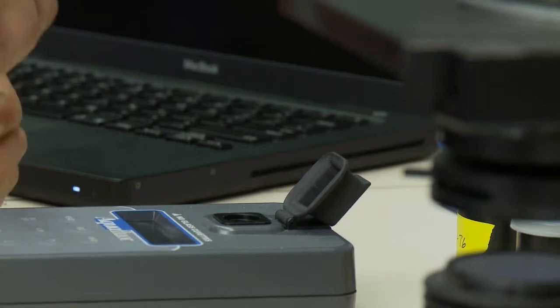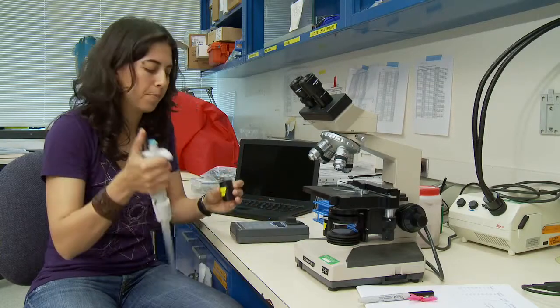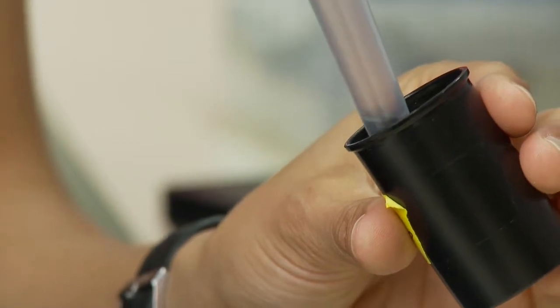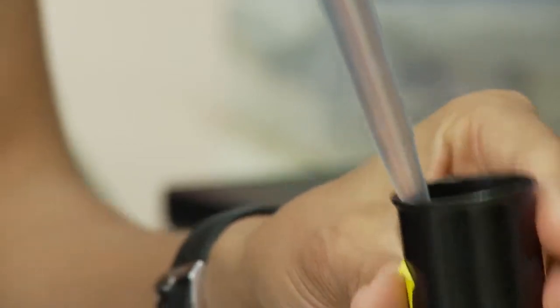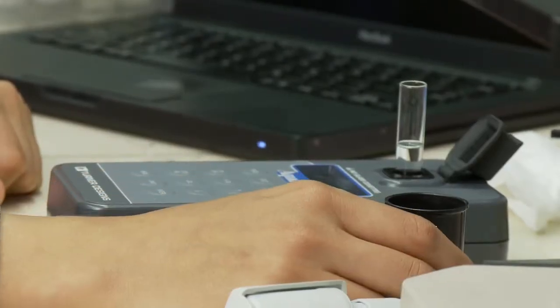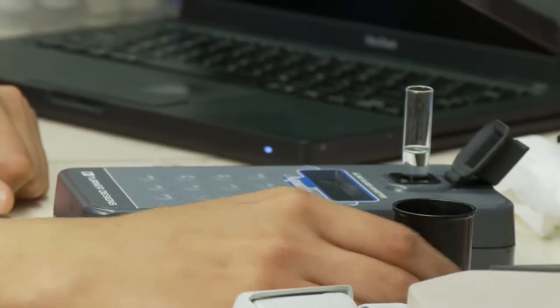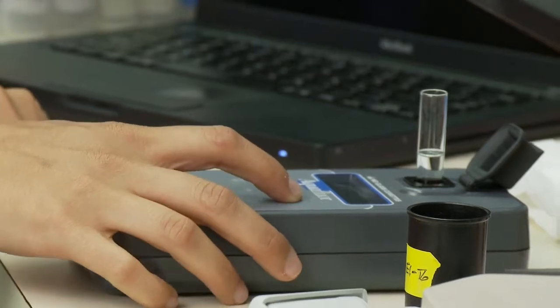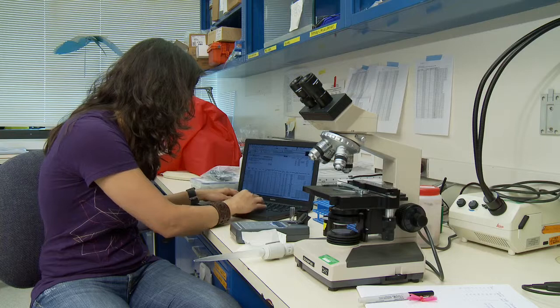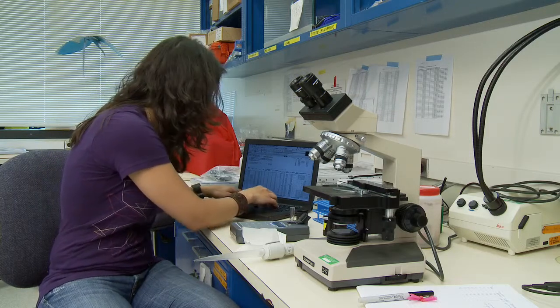The first thing we do is draw out an exact volume from each one of these canisters. I'm going to draw out 3 mils, and then we run the sample, and it's really quick. You get your first reading within about 10 seconds. I type it right into my database here.